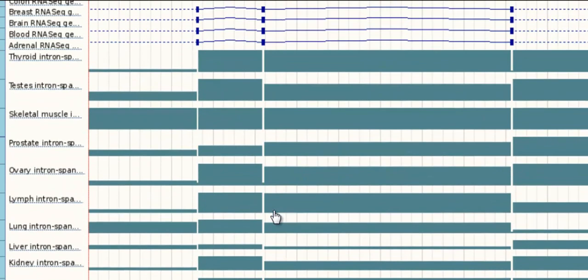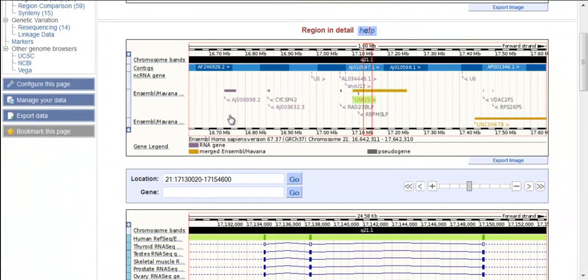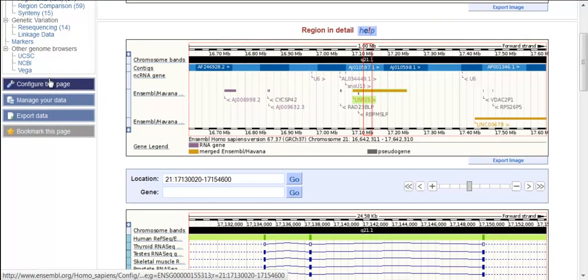Remember, you can turn on more tracks in this page using ConfigureThisPage. Have a look at the RNA-Seq and the GeneBuild video if you want to know more about how these models were generated.